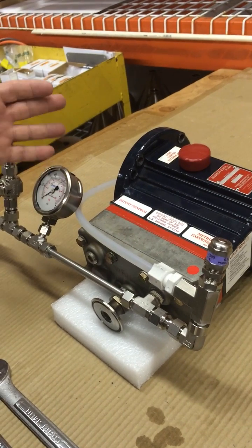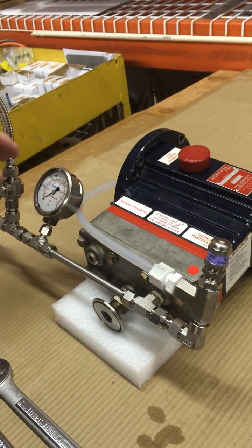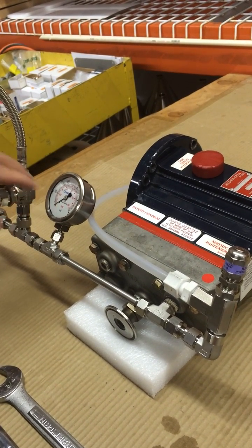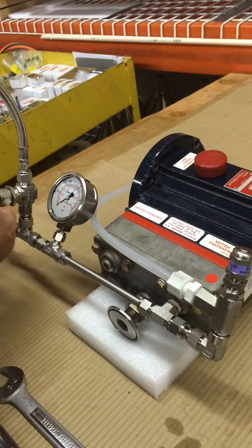The pump is running, the pressure is at zero, and the valves are both open.